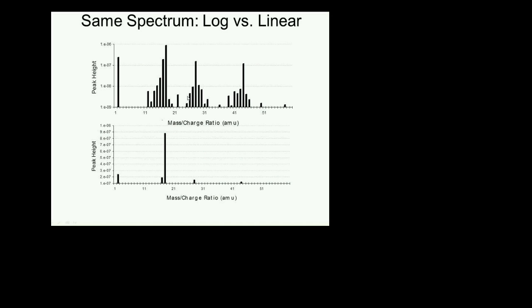There is a lot more information you can have in a log scale. Look at all the information that is in the upper plot relative to the bottom plot. And if you leave your RGA running in linear mode, you're losing all that information in real time. And the good news is that many, many years later, now everybody does this. And you can always set your scale to linear mode if you want.